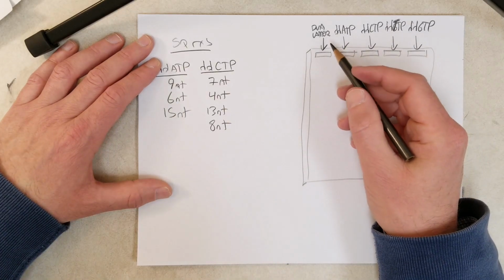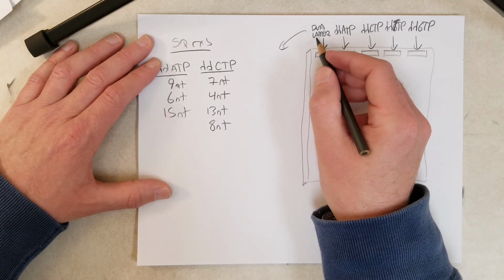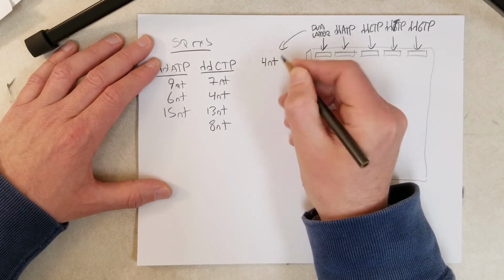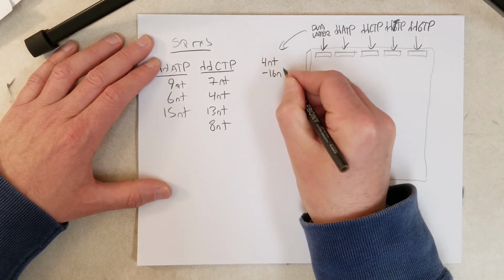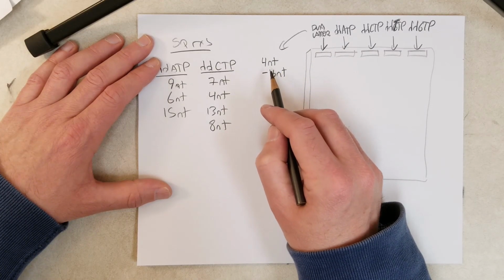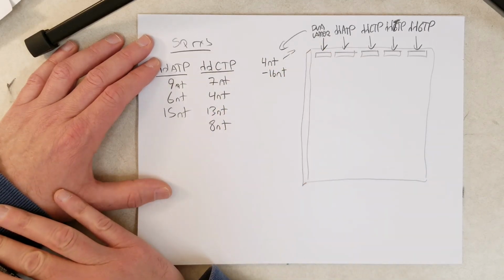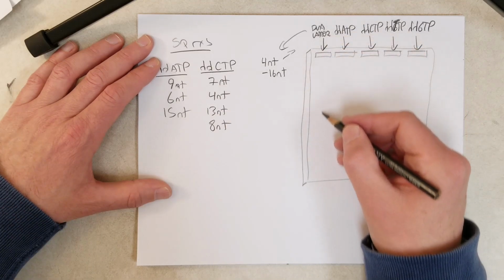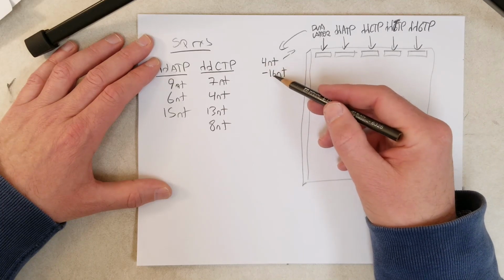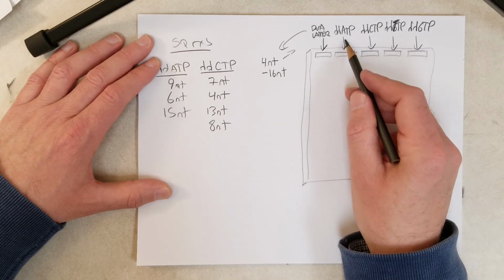So maybe I should just explain that a little better. Sorry about that. Let's say we ordered a DNA ladder from a biotechnology company, and this ladder has molecules 4 nucleotides long, 5 nucleotides long, 6 nucleotides long, all the way up to 16 nucleotides. So all those molecules are in this DNA ladder. When we run this DNA ladder here, we can see a DNA molecule of every size from 4 to 16 nucleotides, and that's going to serve as a good reference for the molecules in these reactions right here.